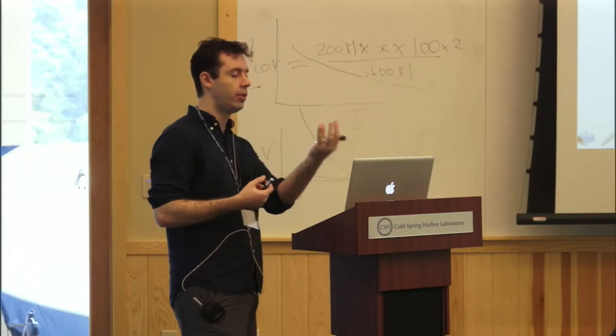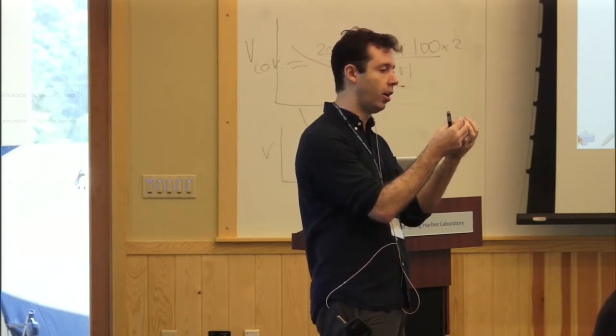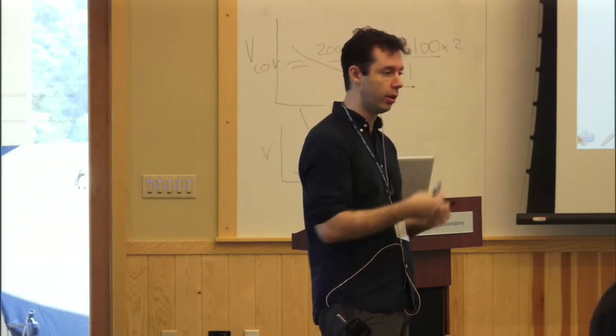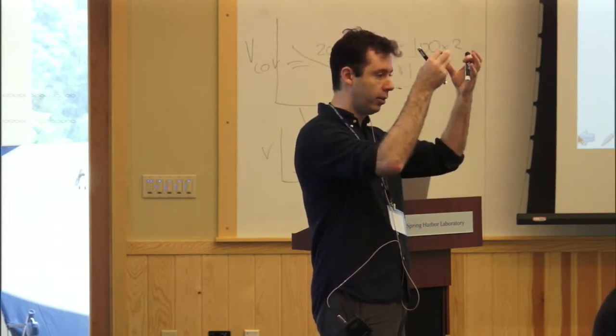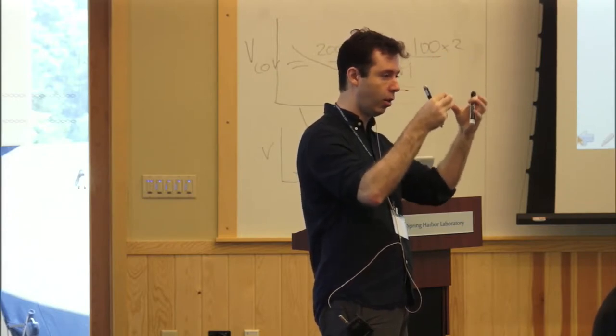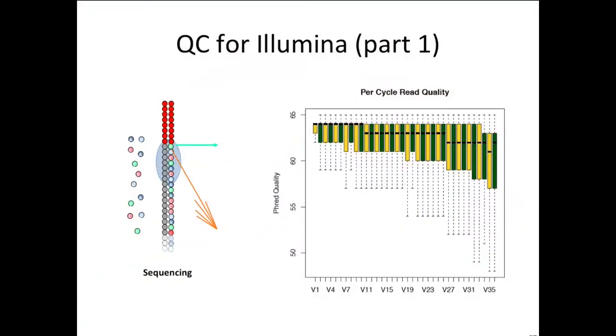So remember that you're sequencing from clusters of DNA fragments, right? The fluorescent signal of the cluster assumes that all of the sequencing is going to occur synchronously across all of the fragments. So like you say, if there is a misincorporation, or two nucleotides are incorporated one after the other by mistake, you create a shift in terms of coordination of some of the DNA fragments.